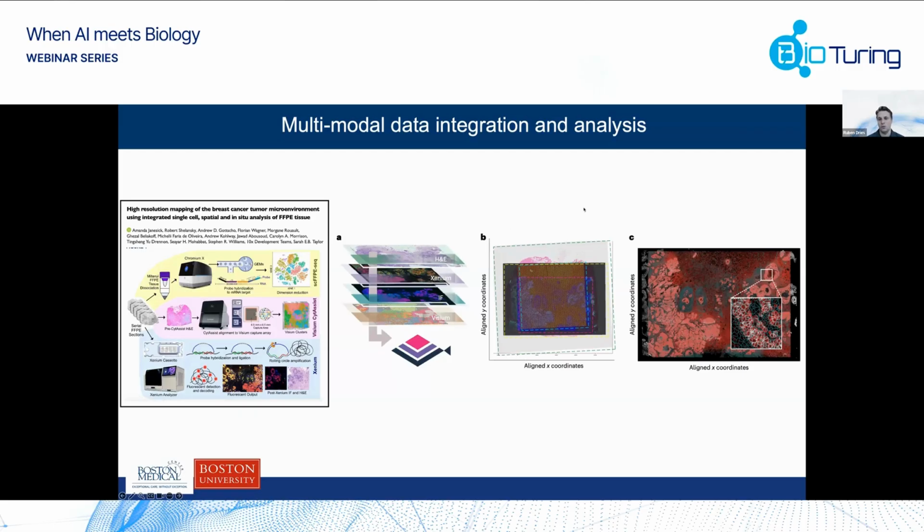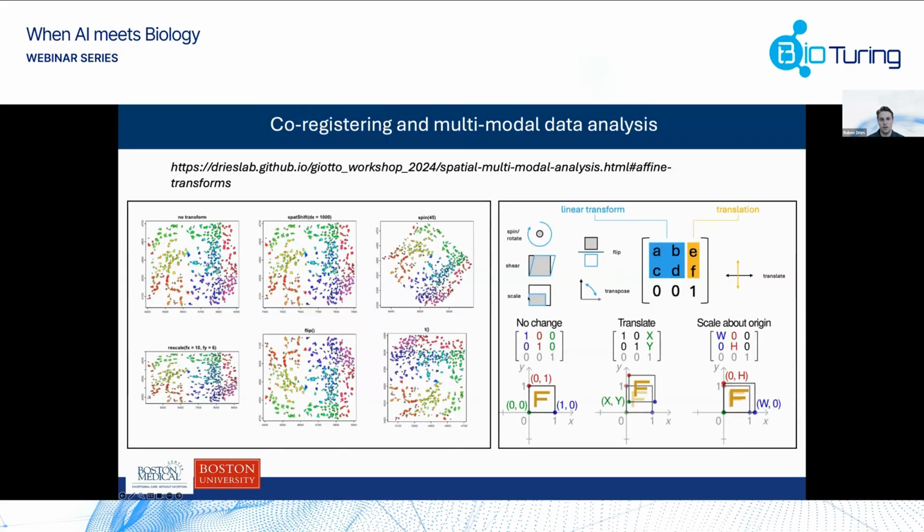And then one issue is, you can do this with really any type of data set, how do you align all of that? As I said previously, we have built dedicated methods to flip, rescale, shift, spin, anything that is necessary, at least for an affine transformation where you're trying to align two different data sets to each other. We don't have non-affine transformations yet. We are working on something that makes that possible. But overall, I think a simple linear or affine transformation works really well for most cases.